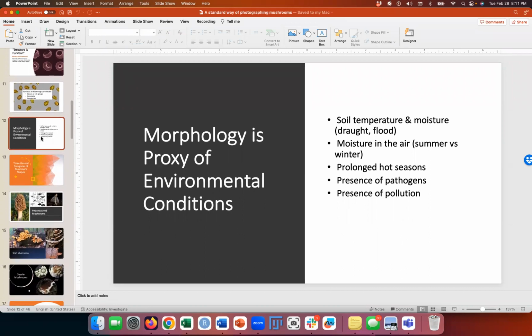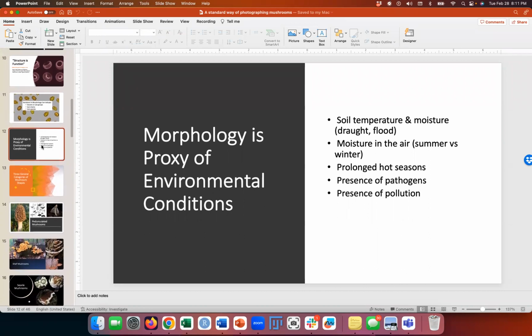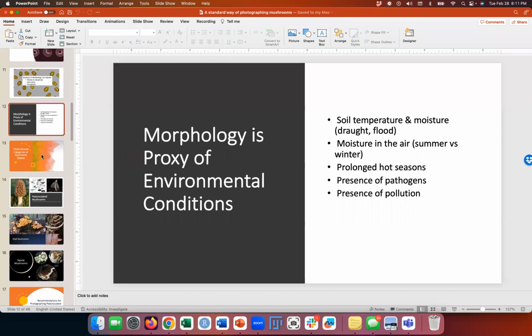And so shape analysis has the advantage in that all you need is a microscope and a camera and software, as opposed to genomic sequencing, RNA, DNA sequencing, which is more costly. It tells you something different. But shape analysis with images is just more cost-effective and easier to do, and it tells you something different than what you know.